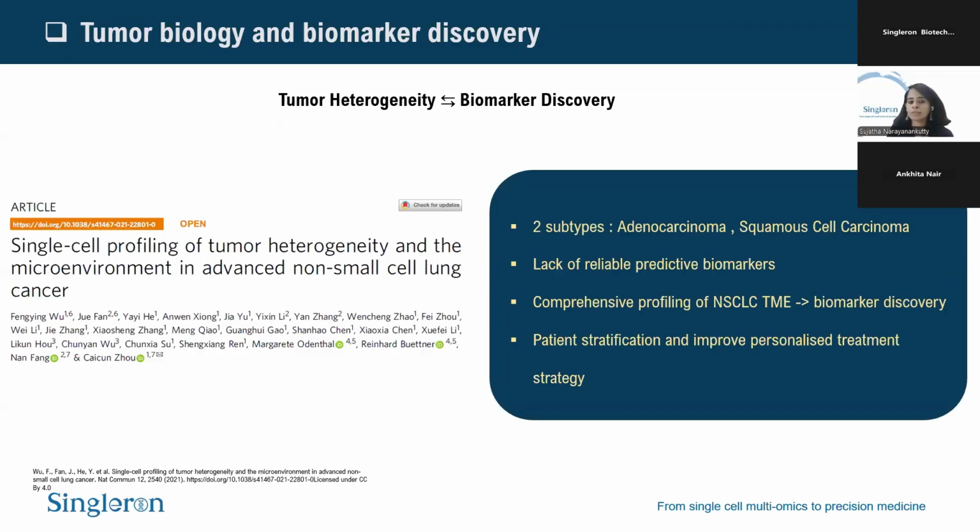So the authors decided to comprehensively profile the tumor microenvironment and get that data so you can actually make a biomarker discovery. And then once you have biomarkers, you can see interesting biomarkers in the data set, you can then decide how you want to do your patient stratification and then improve personalized treatment. So all of this goes together, depending on which stage of the research you are at.